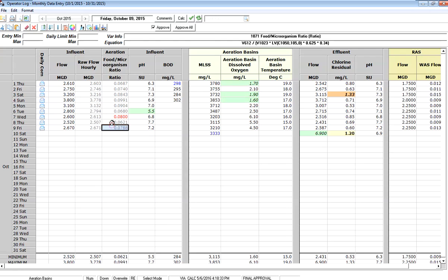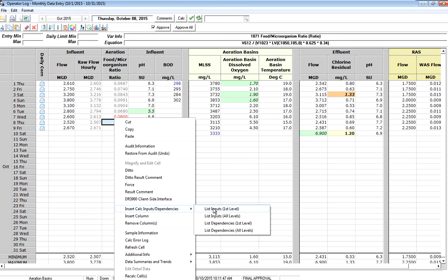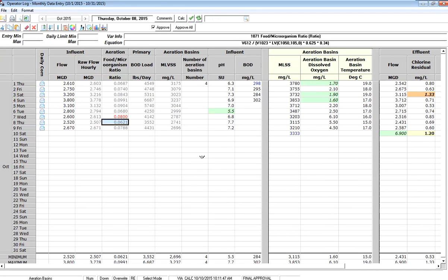So what we have is the ability to list the inputs into the equation so that you can troubleshoot. And again, I can get to this in one of two ways. I can right-click and go to insert calc inputs and dependencies, list inputs right here. I can also use a button called right here, a shortcut called list the equation inputs.